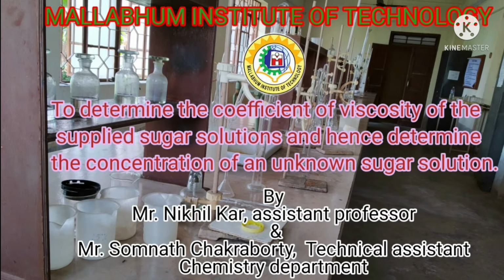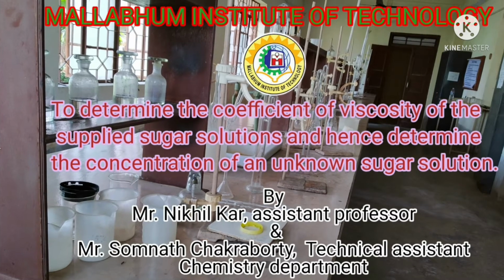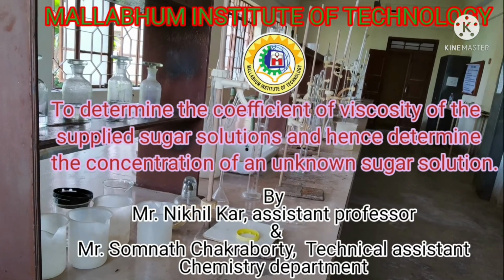Today we are back with another video of BTech First Year Basic Chemistry Experiments. The name of the experiment is to determine the coefficient of viscosity of the supplied sugar solutions and hence determine the concentration of an unknown sugar solution.